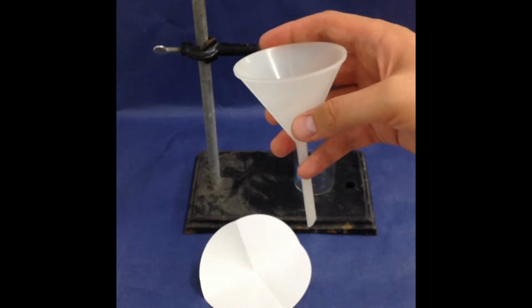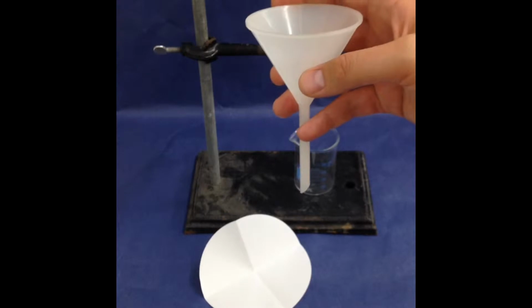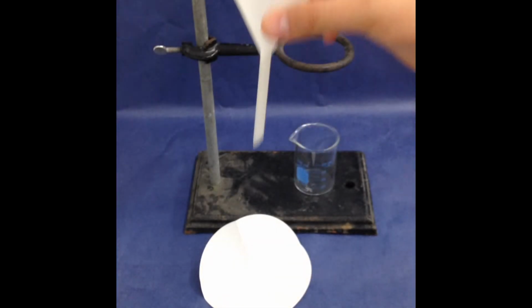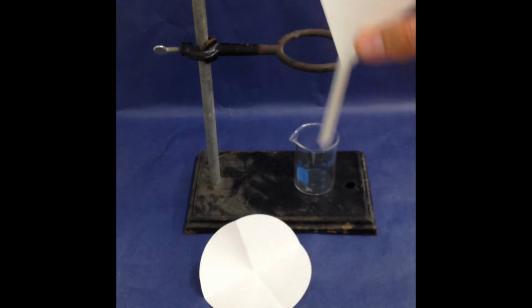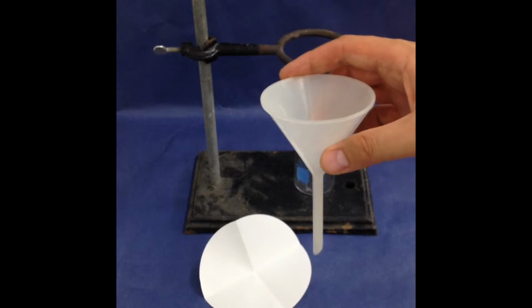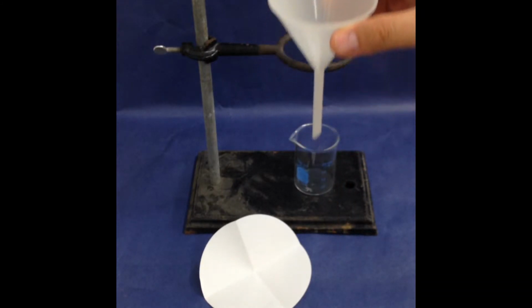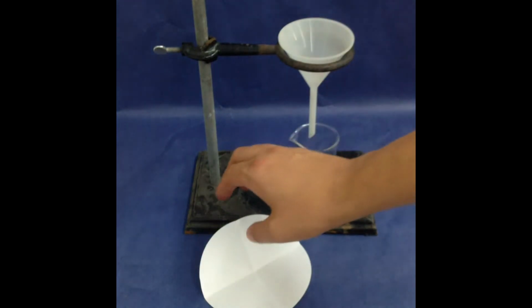So you'd use a funnel for putting liquid into something that has a thin opening, like you'd put this inside a test tube, or maybe a graduated cylinder, or maybe a burette. All right, so that's definitely one use, is liquid transfer. The other common use for a funnel is to make a filter.